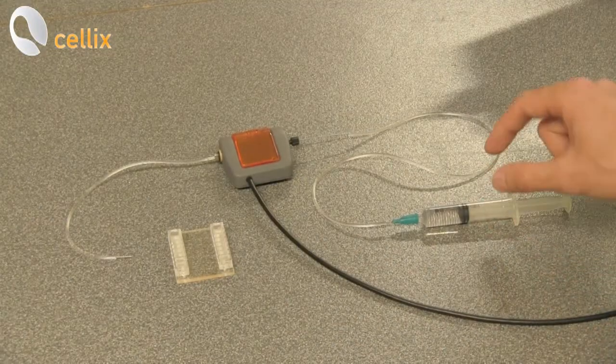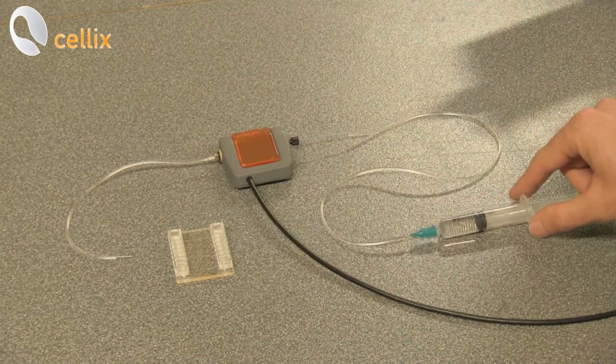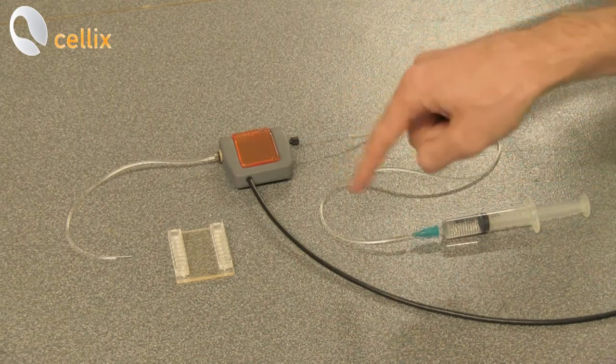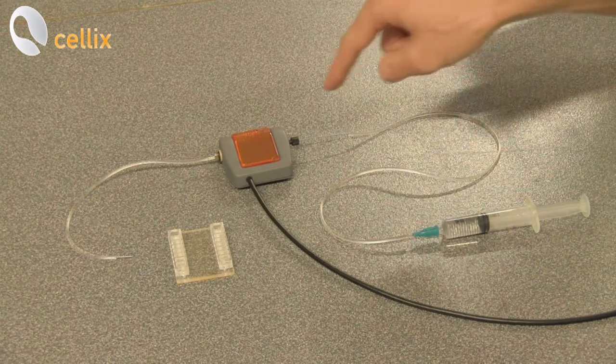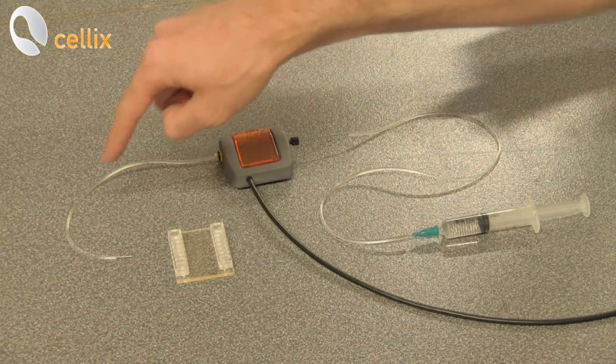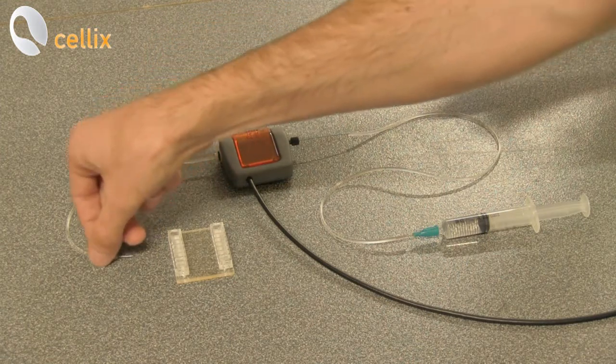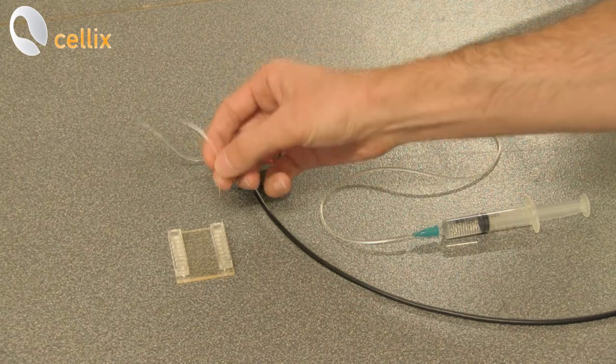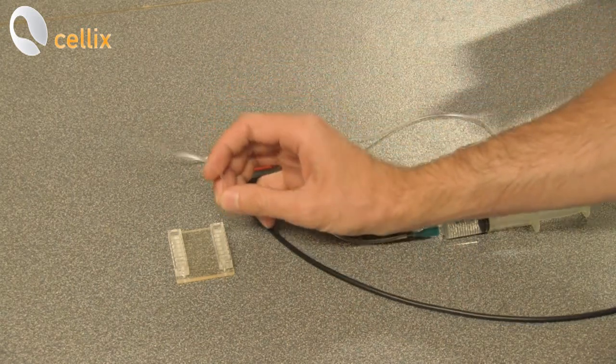The syringe is connected to the Exigo sensor using a Tygon tubing. This is the inlet cable of the sensor. The same thing it is for the outlet. This is the outlet tubing of the sensor. We have a special needle here. We can plug this in into the inlet of the biochip.